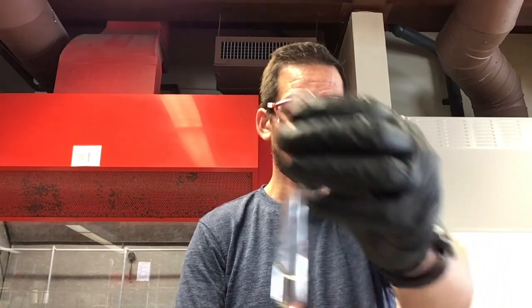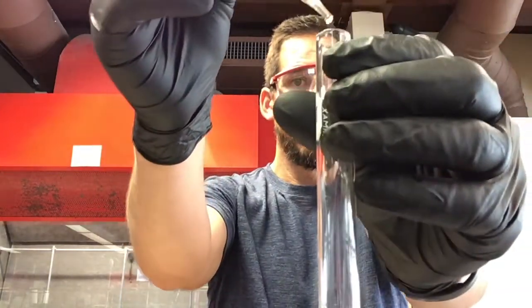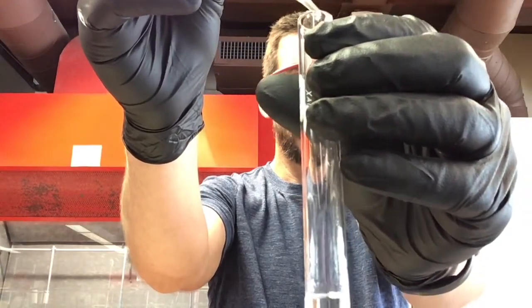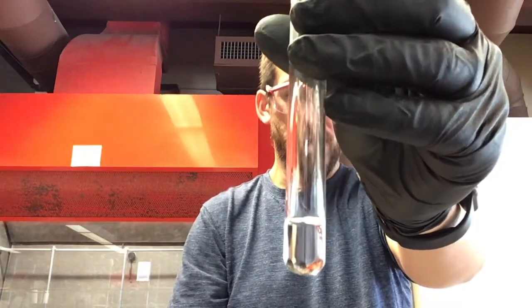So this first one right here. Oh, and I do want to mention that I already set up that water bath because I'm an adult and I plan ahead, because you don't want to get to the point where you need to use the water bath and then wait for it to warm up, right? So, all right, here's test tube number 1, which is 2-chlorobutane. 1, 2, 3, 4 drops.